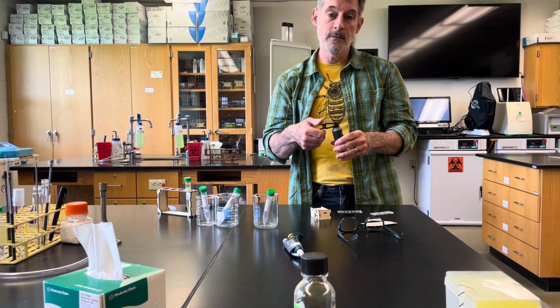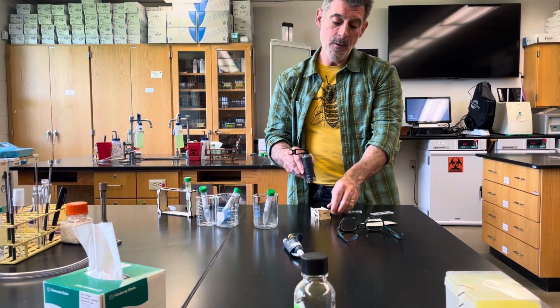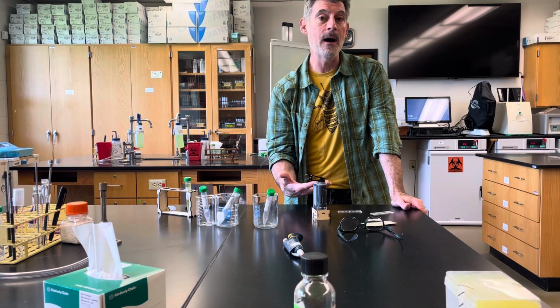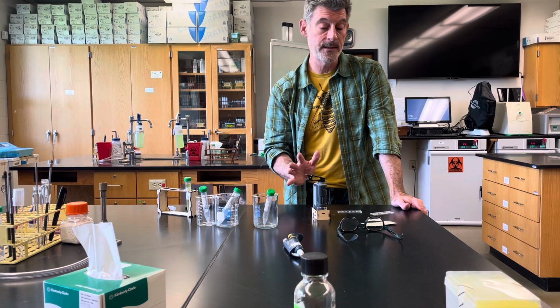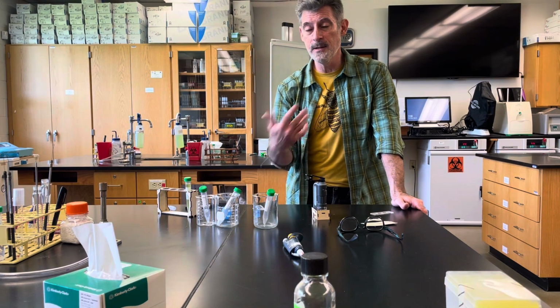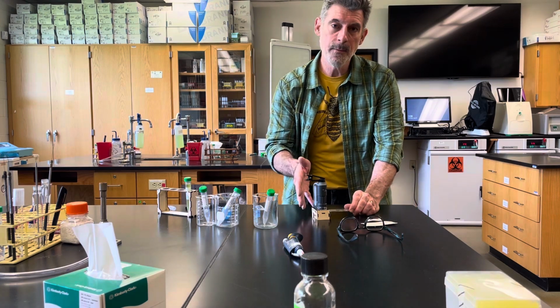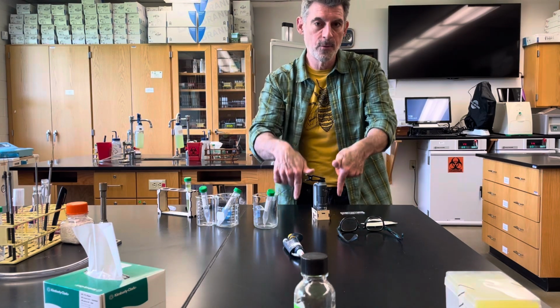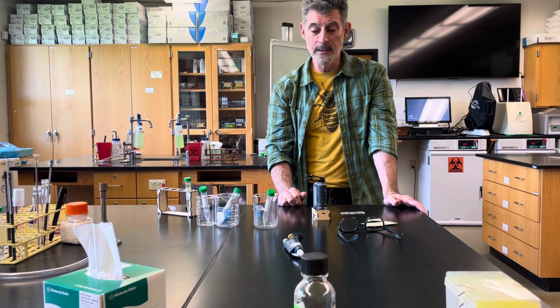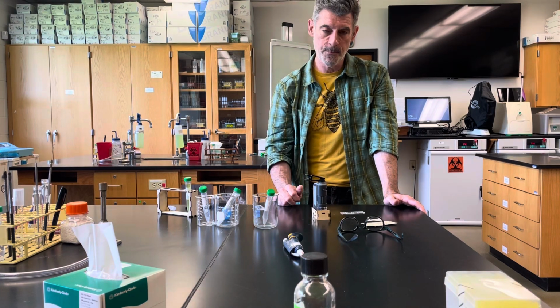You're going to need a phone camera to take photos and videos of this, partly because it's going to make it, one, very easy to count the cells with it. Without it, it's actually pretty difficult. Secondly, you have to show proof that you actually did this. If you turn in the data and you answer a bunch of questions, but I don't see a photograph of your slide set up on your microscope, and I don't see a photograph taken through the microscope of the cells on the slide, you can't get credit for doing this because I don't know that you actually did it. So you have to actually show me that you did it with those pictures.